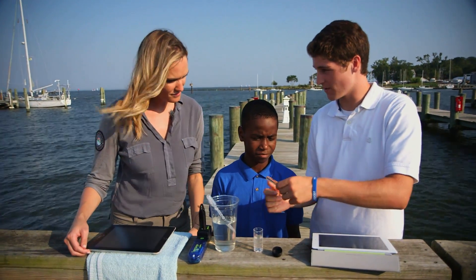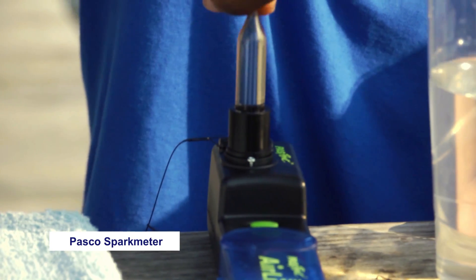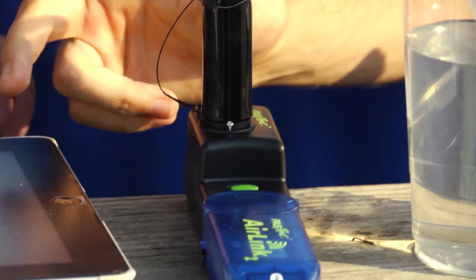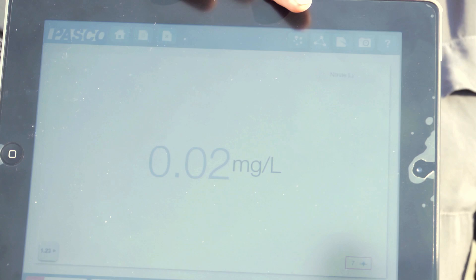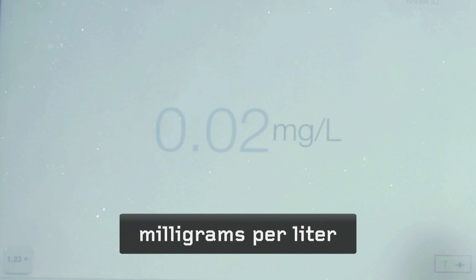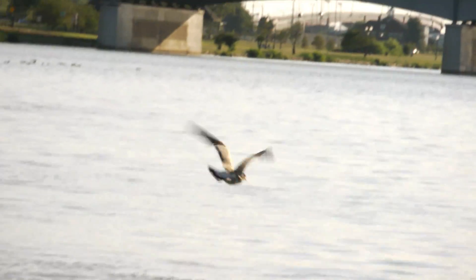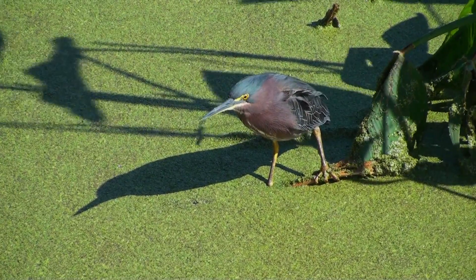First we have to clean off the fingerprints. AJ can you put it in here and then push it in. I'm gonna cap it and press go. All right, so our reading is .02 mg/L — that means milligrams per liter. For every liter there's that many milligrams. So this is relatively low for the nitrates in the water, which is great. It's not going to promote growth from the algae bloom.